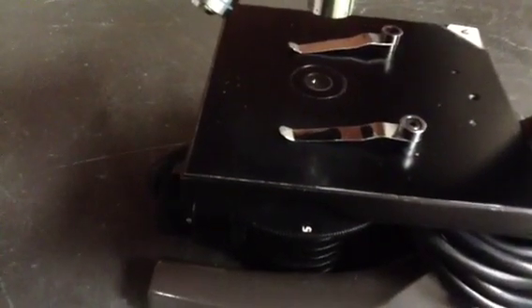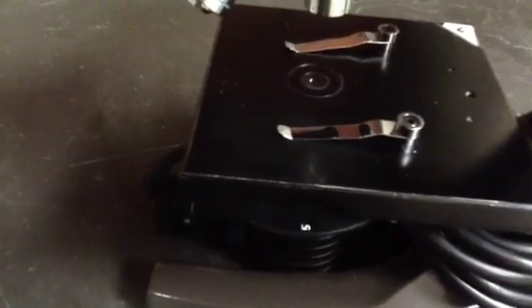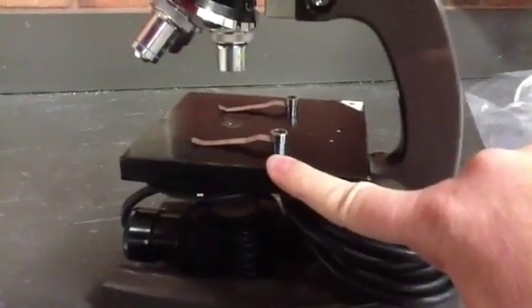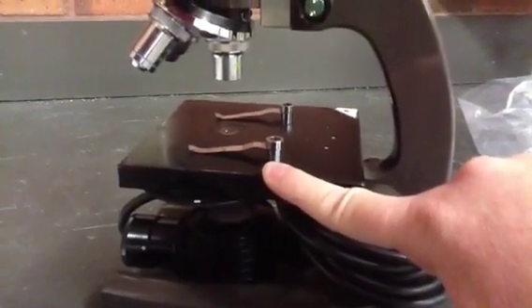These are the stage clips. These are used to hold your slide in place while you're trying to view it. This part is called the stage. It's used to support the slide that is being viewed. This is the light source. It projects light upwards through the diaphragm, the slide, and back into the lenses.